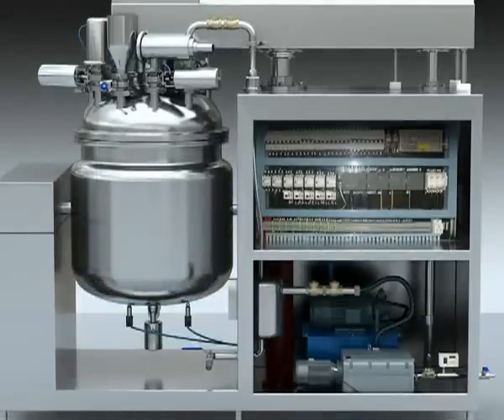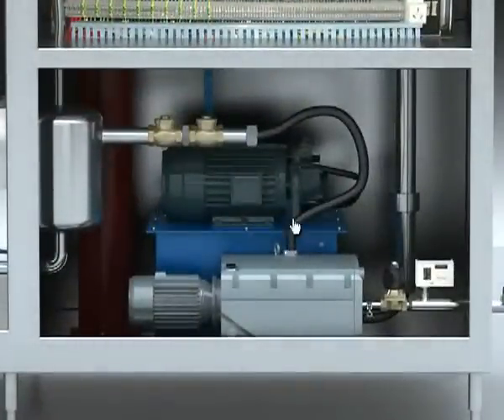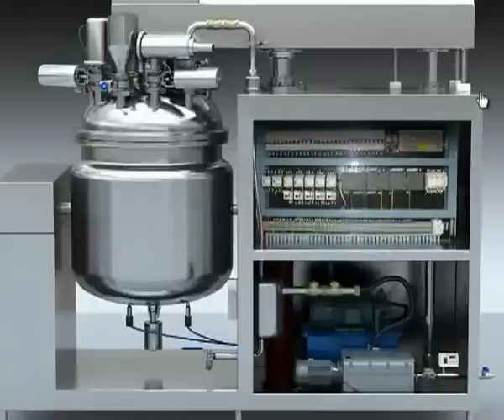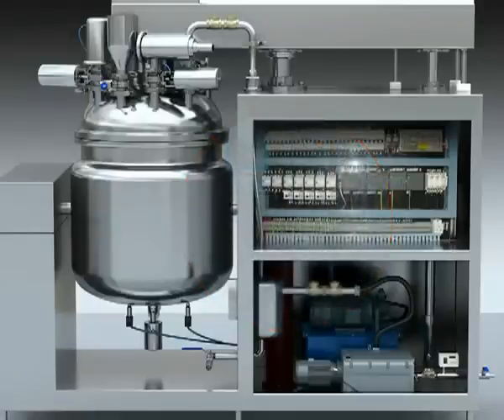3. Hydraulic system. It is made up of a hydraulic pump, hydraulic cylinder, reversing solenoid valve, overflow valve, upper limit switch, lower limit switch, discharge production range, and safety switch.